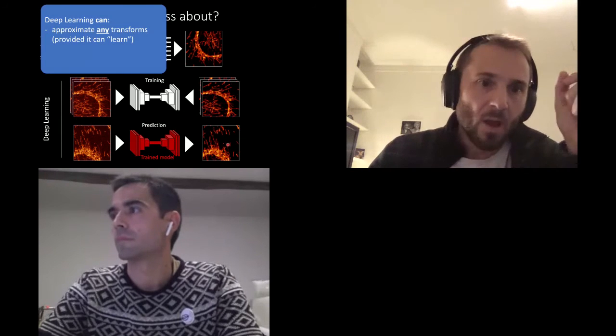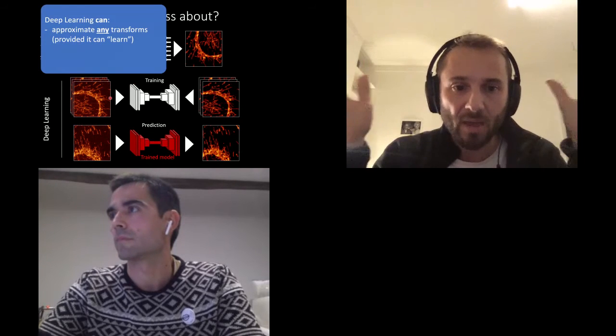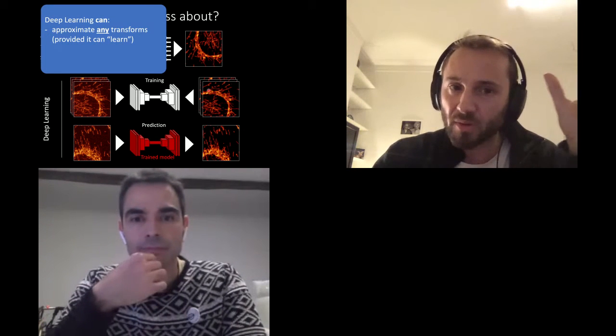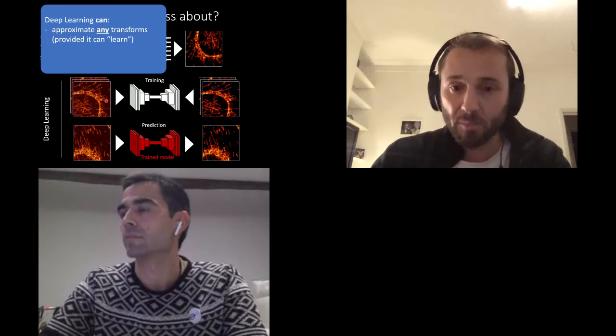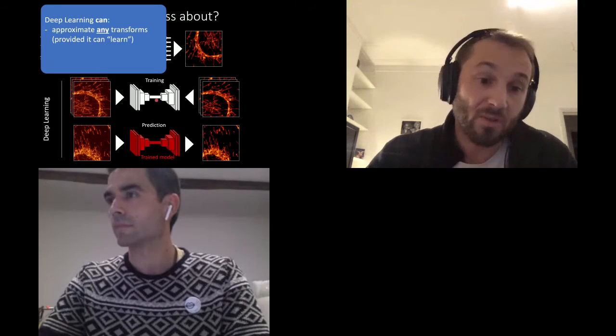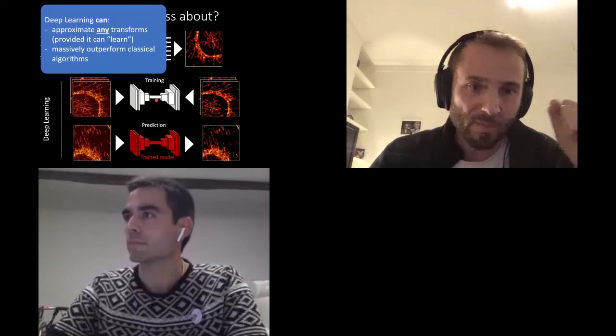So the fuss about deep learning is twofold in my view. One is that it can approximate actually any transform, right? In the framework that you've seen today, there are no real limitations in terms of what you feed as input and output, as long as it can learn it. And we can discuss afterwards what this means. But that opens up a lot of different tasks for deep learning to work on, even using similar architecture. A similar architecture could learn lots of different types of bioimage analysis tasks, and so that makes it extremely versatile. And so that's powerful from that point of view.